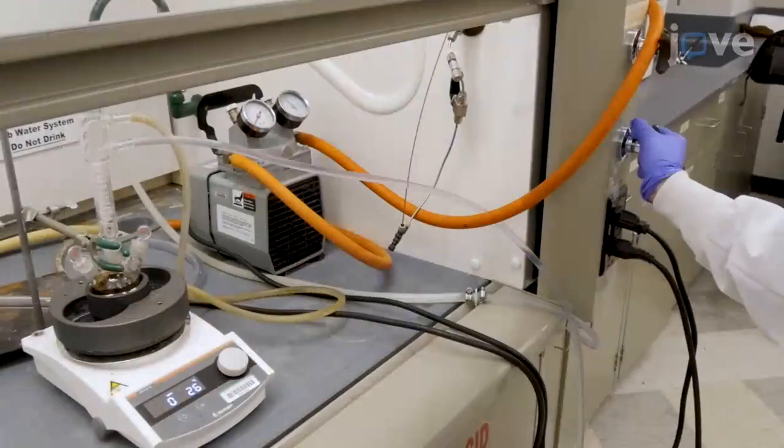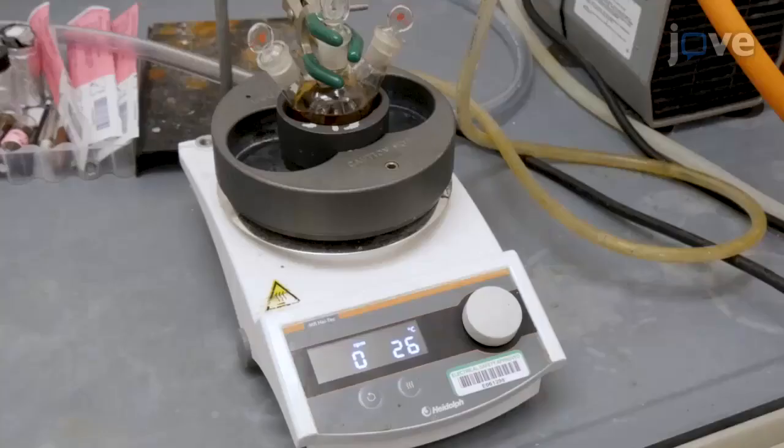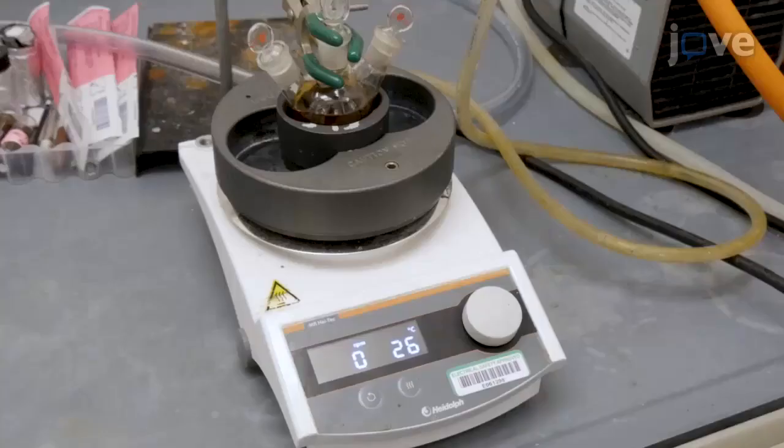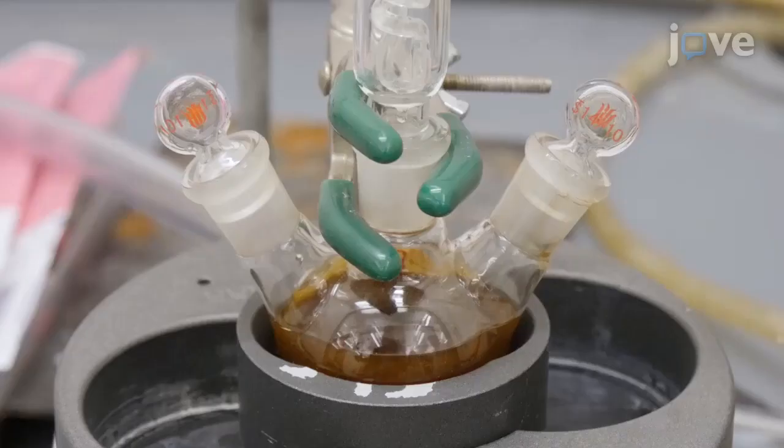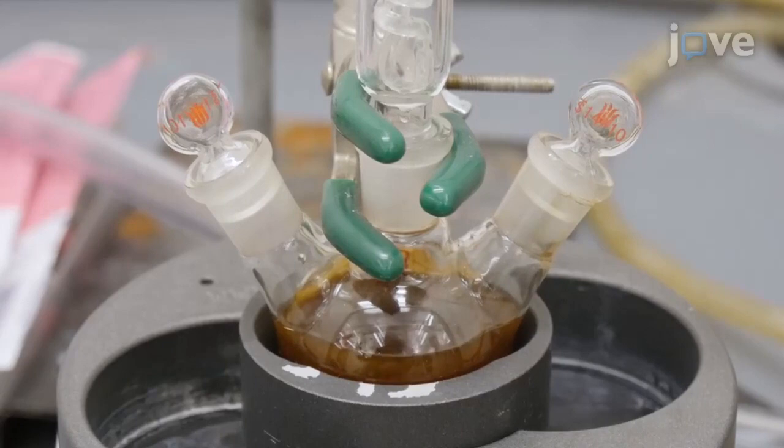Slowly open the condenser water valve and allow the water to flow through the condenser. Stir the solution at 300 rpm at room temperature until no more palladium acetate dissolves, which usually takes 10 to 15 minutes.